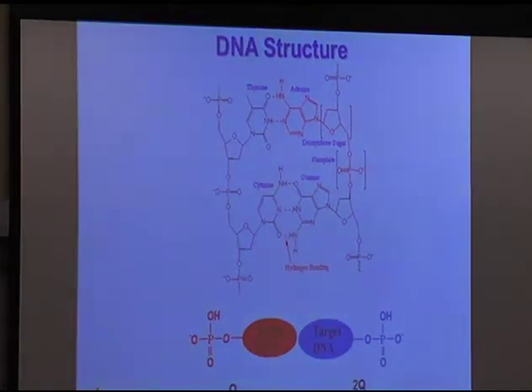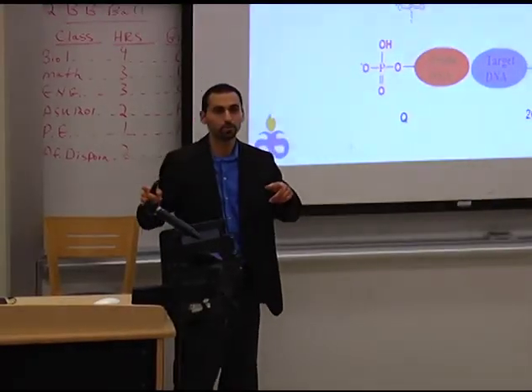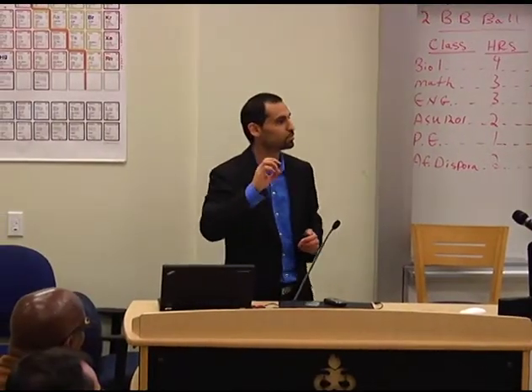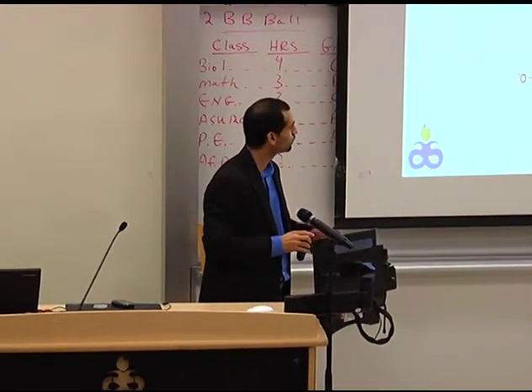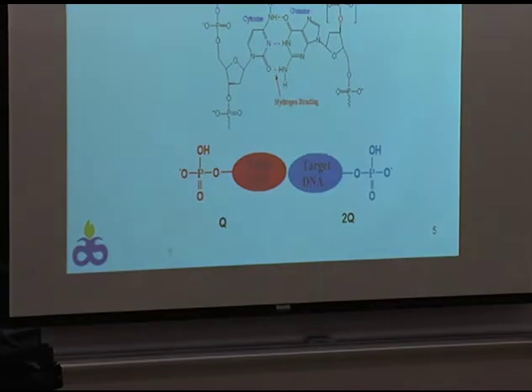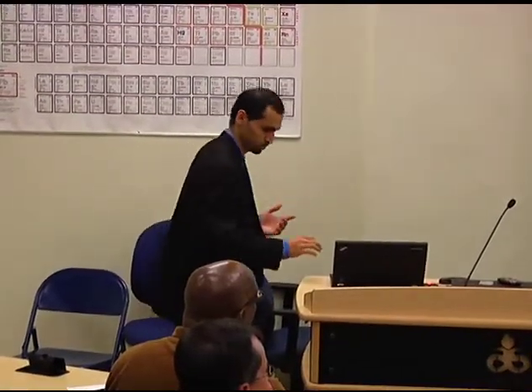But our sequences are larger. We typically use 15 bases for the probe and 27 bases for the target. We'll look at that sequence, and that sequence is directly from that gene, the GSTP1 gene. We're looking at that gene once again. So again, you determine what target you detect based on the probe you select. Just like with any particular type of lock, only a certain key can open it. You make it selective to that key.